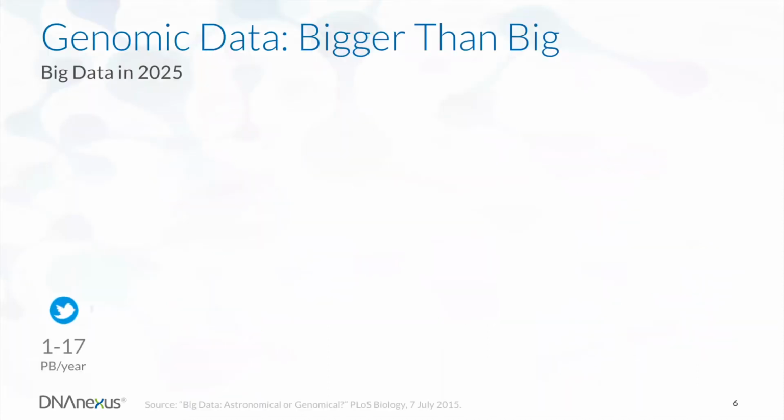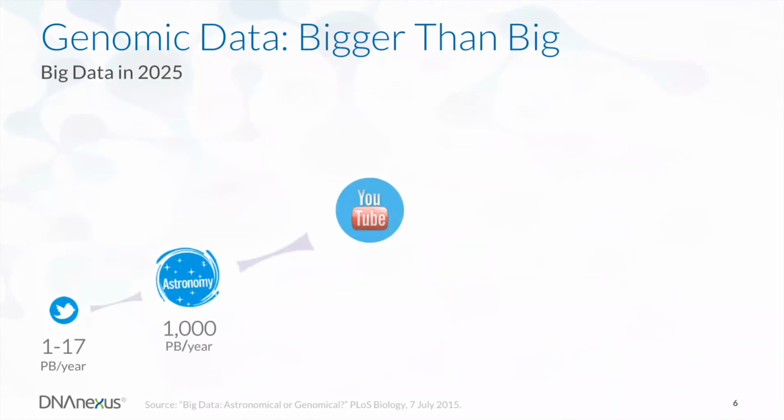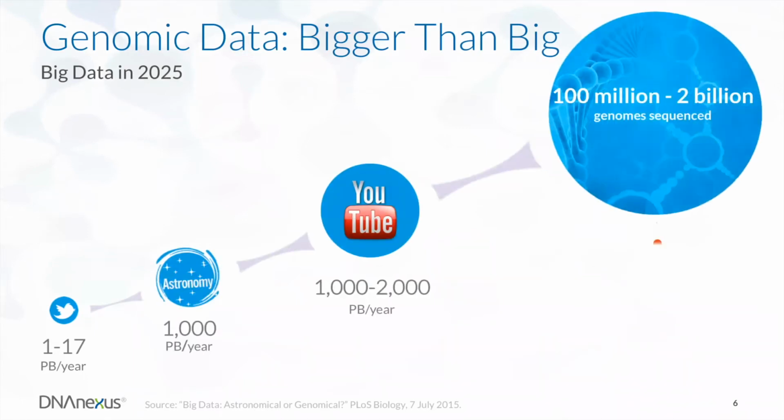The last slide that I'm going to talk through is just to give some framing for why players like Sentieon and DNAnexus are going to be important in the coming years. I think that everybody in this space has recognized that the amount of genomic sequencing is increasing exponentially. Just 3 or 4 years ago, having a 10,000 exome project was an enormous deal. Not many places had that. And now people are talking about hundreds of thousands of genomes as the standard project that will be executed.